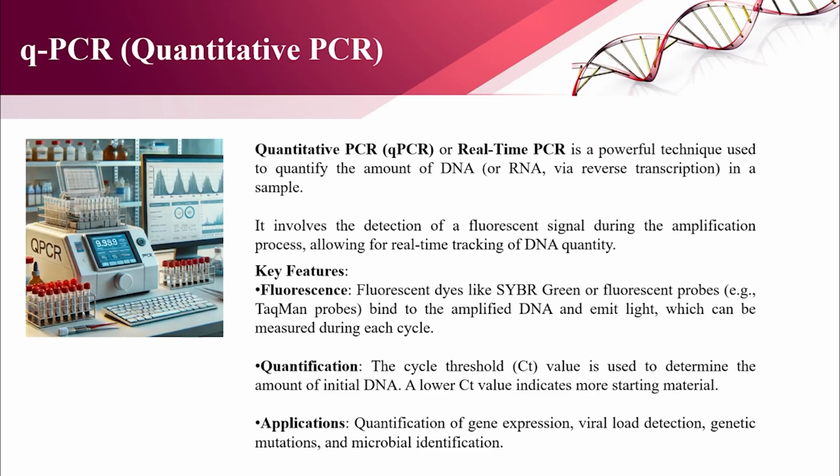Here we will talk about qPCR. As I discussed before, we have so many types of PCR like conventional PCR, RT-PCR, and then qPCR, but this video is focused on qPCR. So what is qPCR? Quantitative PCR or real-time PCR. And why is it called real-time PCR? Because it can show the amplification in real time, so that's why it's called real-time PCR.